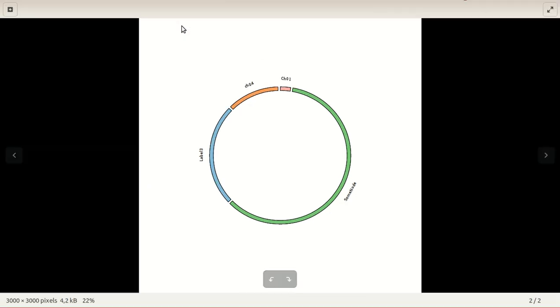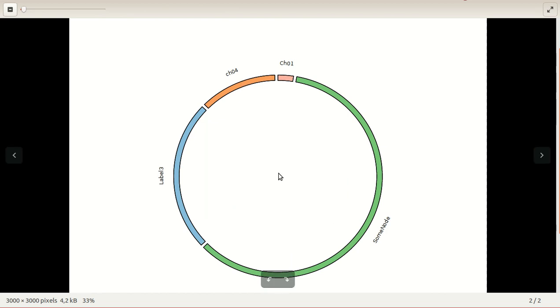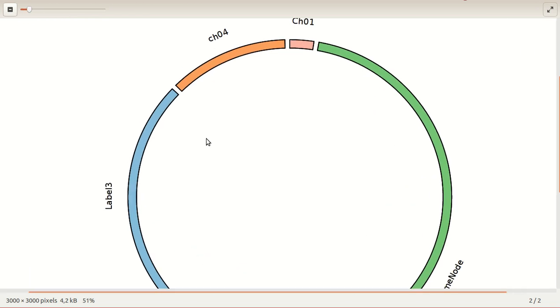And now you can see better, now that I have to specify a smaller radius, like 50% of the unit for a radius that is defined in some other file. It's a smaller circle. Also, you can see that these nodes are thicker, and the border is black instead of gray, and it's supposed to be thicker too.